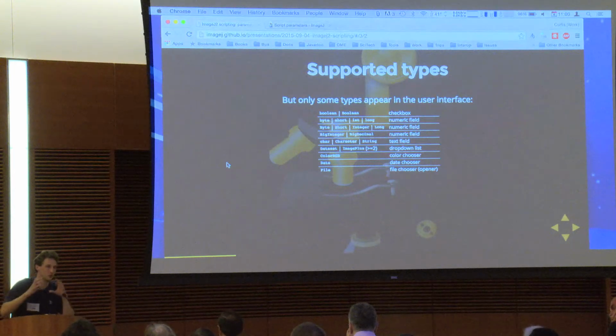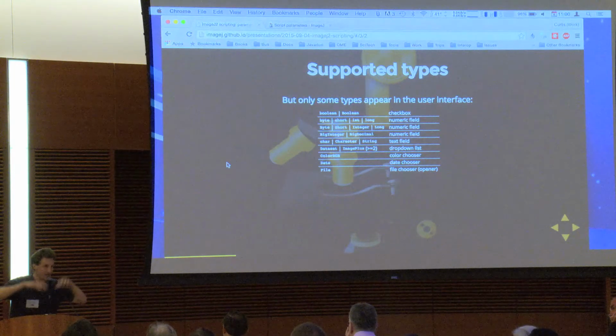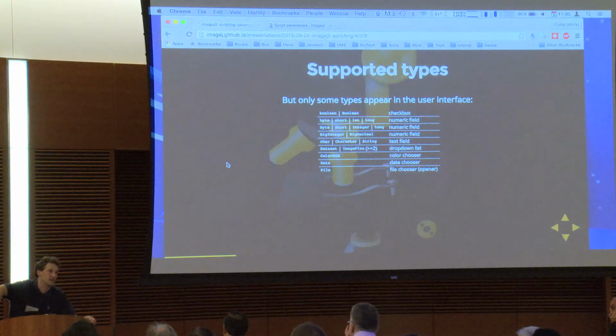And same thing with grouping them into columns. ImageJ1's generic dialog has some advantages still right now, like Wayne demoed in his presentation, grouping things, and he showed radio buttons. Yeah, so we have radio buttons as well, but you can't do grids. You can only do horizontal, vertical. But all these things are doable. And just like I said yesterday, it's a complaint-driven project. So if you say, I need grids of radio buttons, or I need 2 columns, it can happen faster.